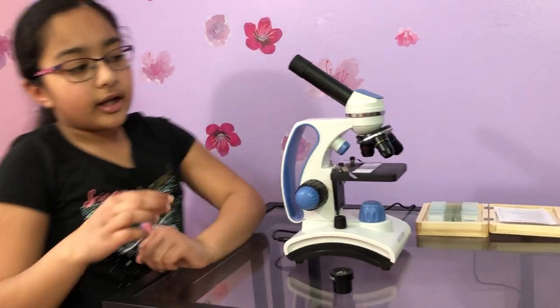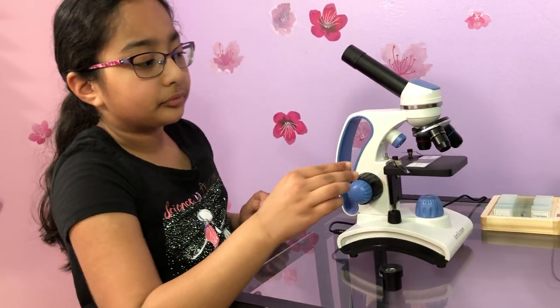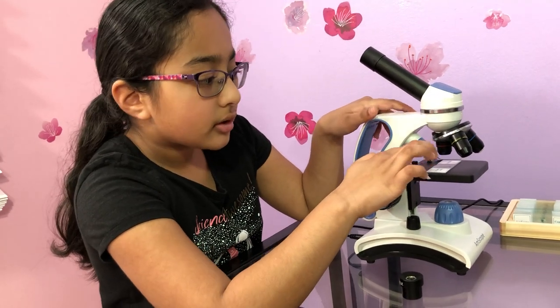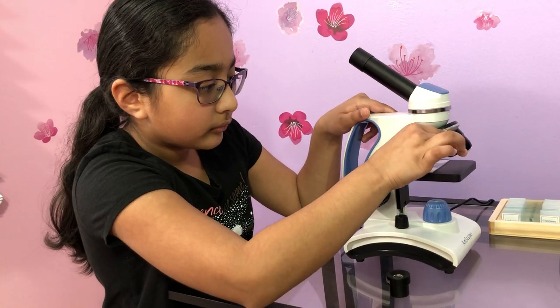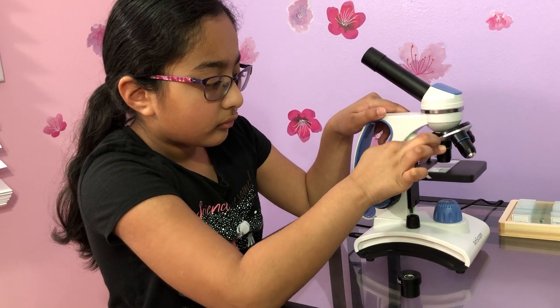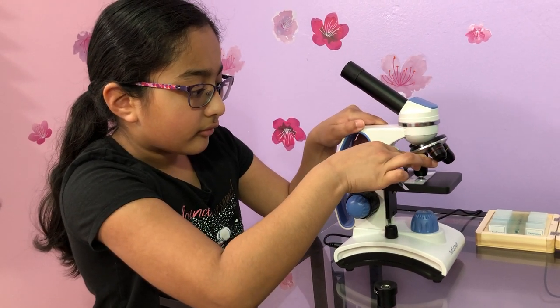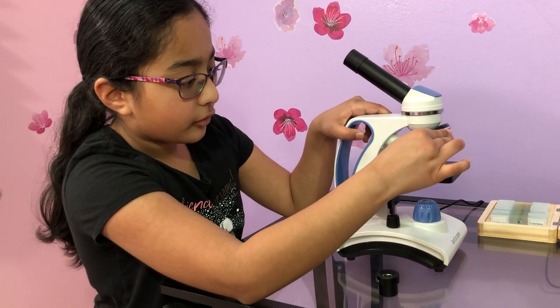I have three different magnification levels on the objective lens. This one's 4, this one's 10, and this one's 40.